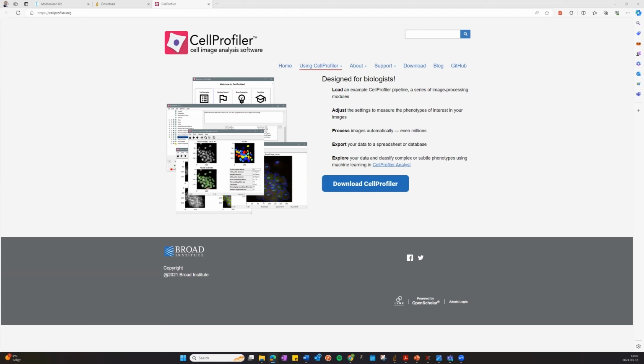So this segmentation allows for the specific quantification of the number of RCPs that are detected in only the Atto 565 or only the Atto 647 fluorescent channels. And these represent the free non-interacting fractions for the 2 analyzed protein targets. But it also enables to quantify the RCPs that are detected in both the Atto 565 and the Atto 647 fluorescent channels. So if you have RCPs that have fluorescence in both channels, that will indicate protein interaction or proximity in the sample between the 2 proteins.